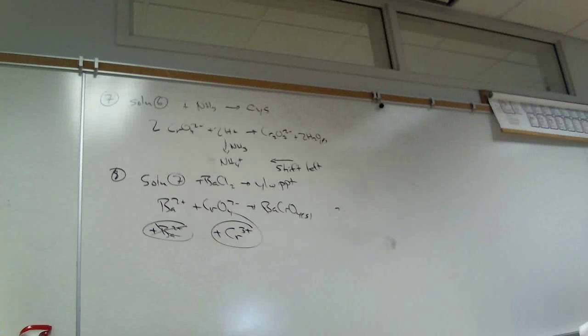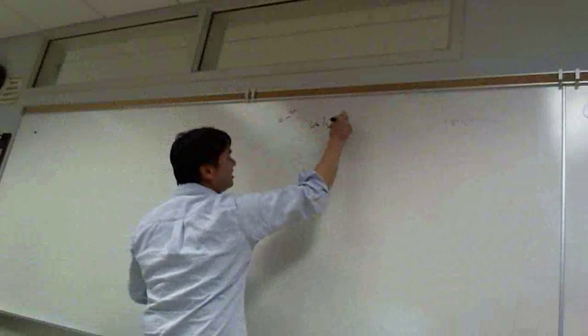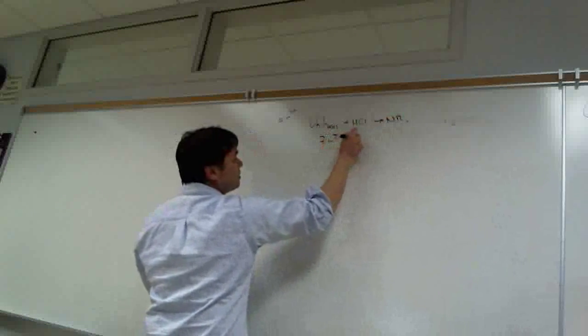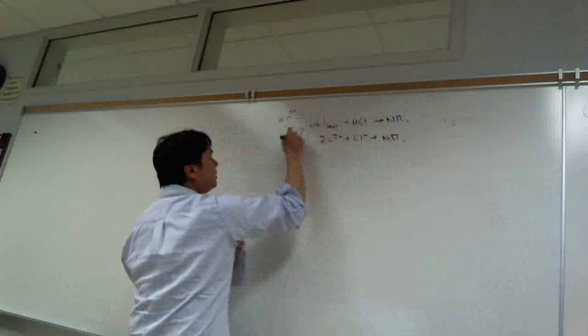All right, the next ion is zinc, is that correct? So Zn2+, let's take a look at that here. So if our unknown solution contains zinc 2+ and we react it with HCl, we expect no reaction here. And that is Zn2+ plus chloride won't precipitate. NR 1, 2.